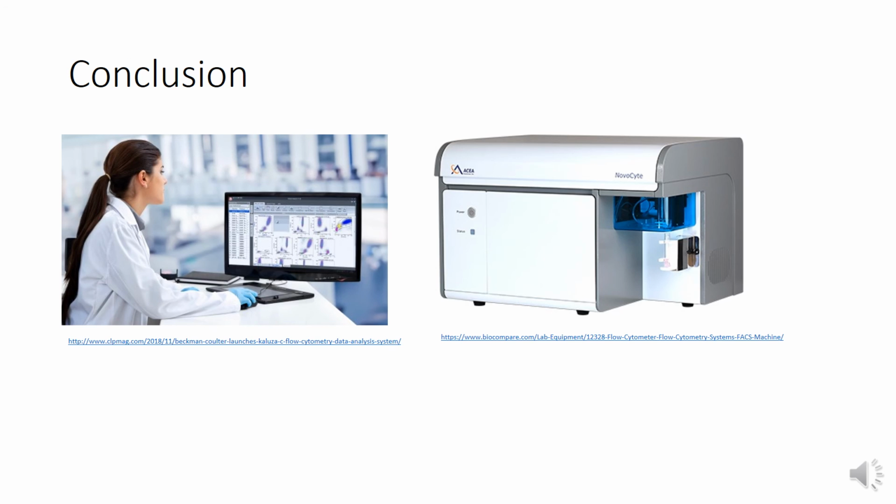In conclusion, the work presented here seems to hold up against a traditional flow cytometer, and while not perfectly matching results from a traditional cytometer, the virtual core obtained results within 2%, but still has room for refinement and advancement. It allows for greater and more diverse use in the field and opens up greater possibilities in the future.